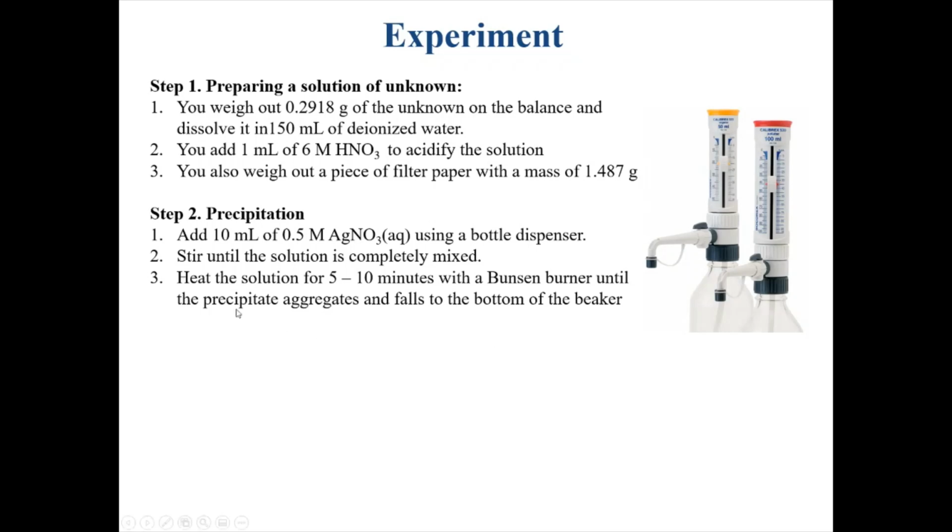So you should know why we heat it with the Bunsen burner as a potential question on the quiz. And this is just to make the precipitate aggregates bigger so that they're easier to filter.